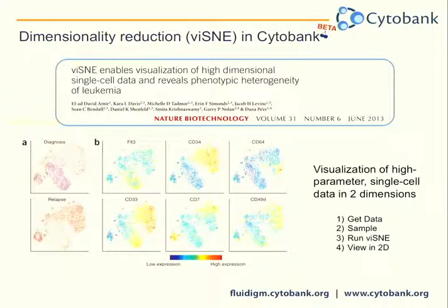So if you've heard of, for example, PCA or local linear embedding or isomap, the general idea for all these methods is that you have your data in high dimensional space, and you just want to look at it in two dimensions or just a couple dimensions so you can really see what the distinguishing features of your sample are.